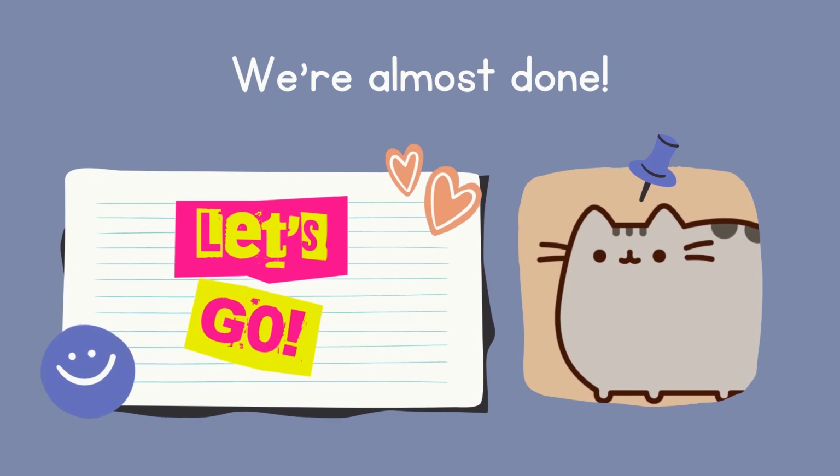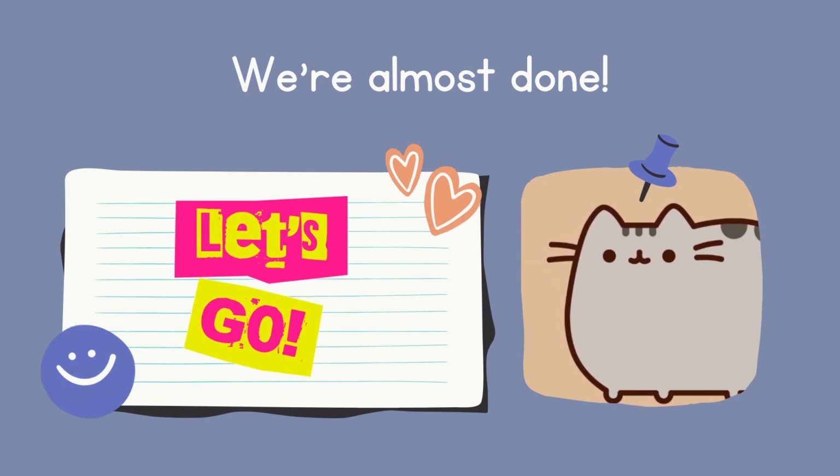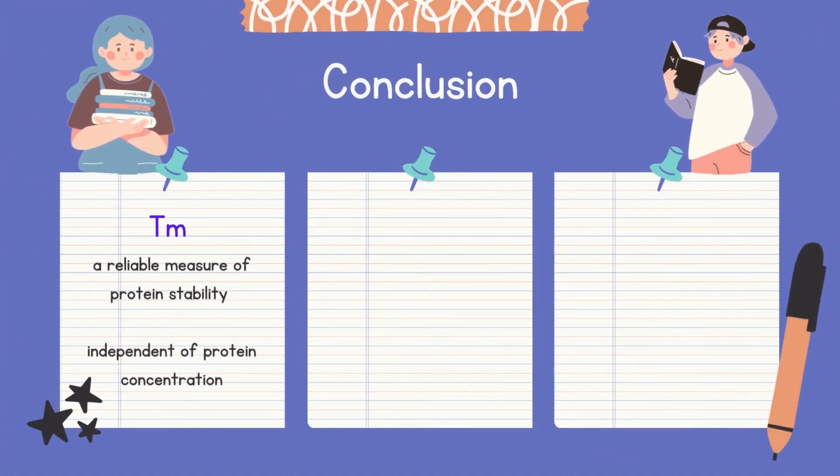With that, we're almost done with the presentation. There's only one part left. Along with the discussion, we know that differential scanning calorimetry is a reproducible technique for identifying the thermodynamic properties of protein unfolding. Specifically, we were able to determine that melting temperature is a reliable measure of protein stability that is independent of concentration, unlike delta H.